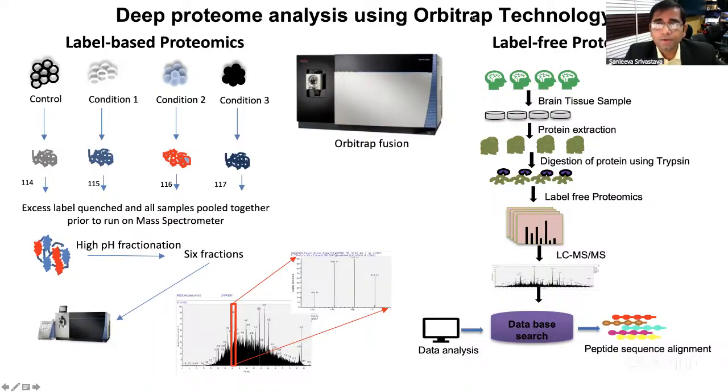And now TS is going to show the instrument, the Orbitrap Fusion, which is one of the tribrid instruments, and we primarily use it for a lot of deep proteomic based analysis and quantitative analysis. So Amit and Ankit, please discuss the Orbitrap Fusion now. Yes, sir. Thank you, sir.